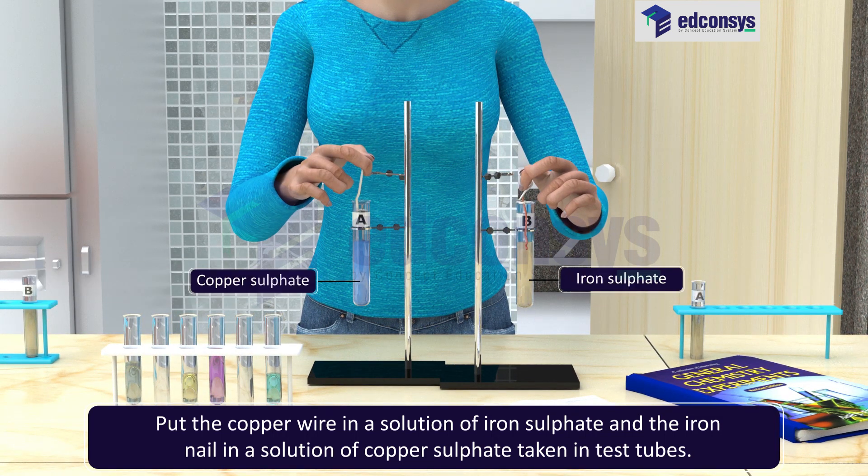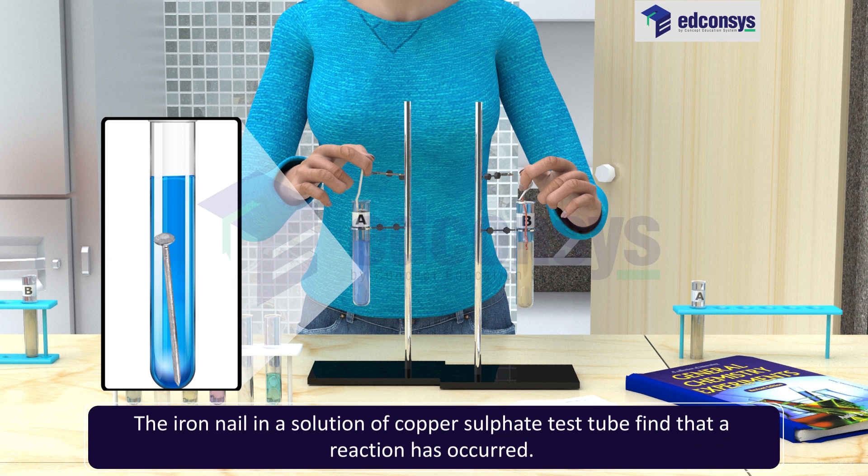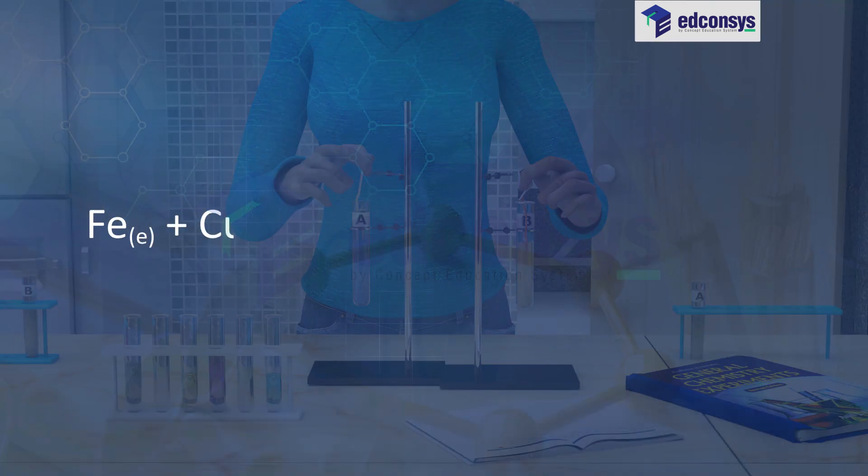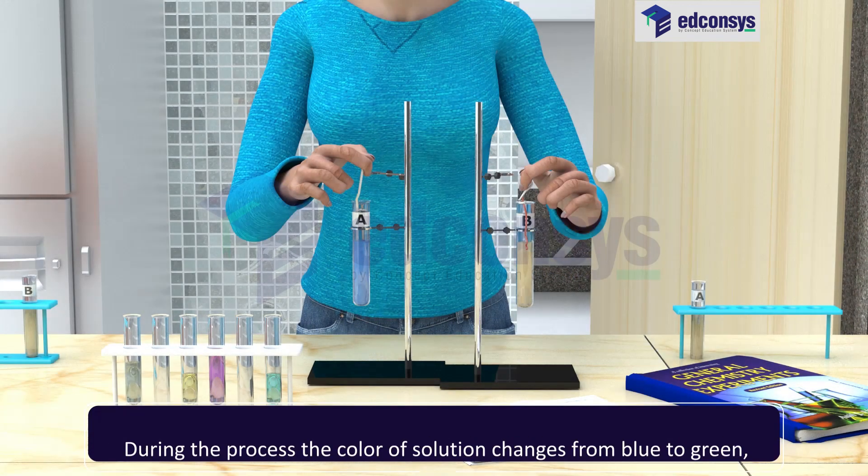Record your observations after 20 minutes. The iron nail in a solution of copper sulfate test tube finds that a reaction has occurred: Fe + CuSO4 gives FeSO4 + Cu. During the process, the color of solution changes from blue to green, which indicates that the process has taken place.